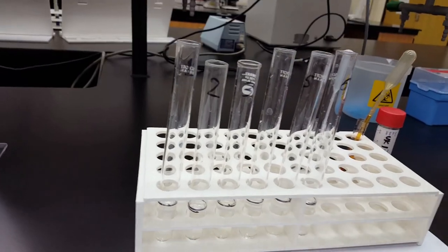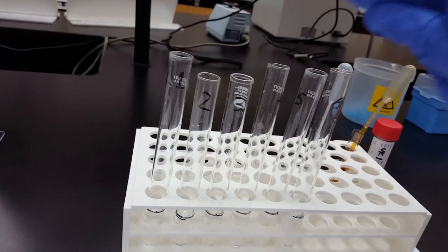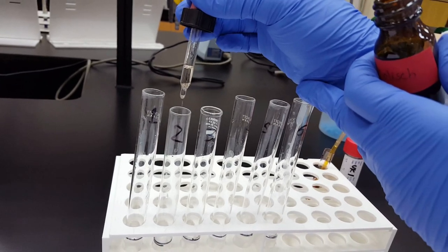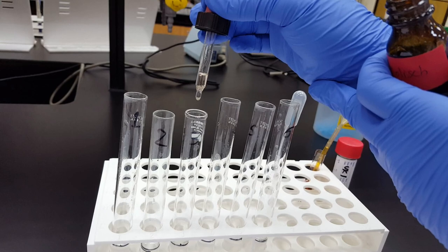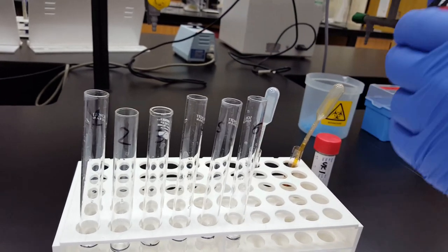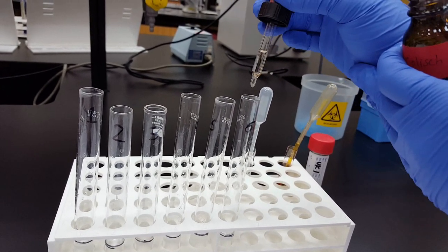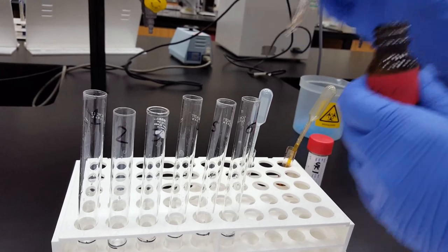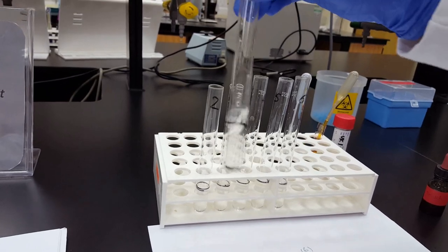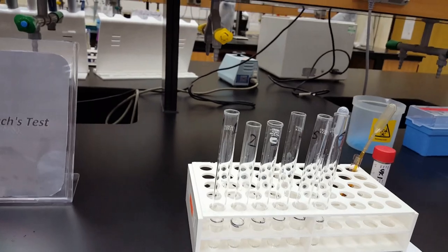So now let's add the 5 drops of the Molish reagent. 1, 2, 3, 4, 5. Again for each tube, including the last two tubes. Once we are done, we have to mix all the tubes, and then we take the whole rack under the hood to add the sulfuric acid.